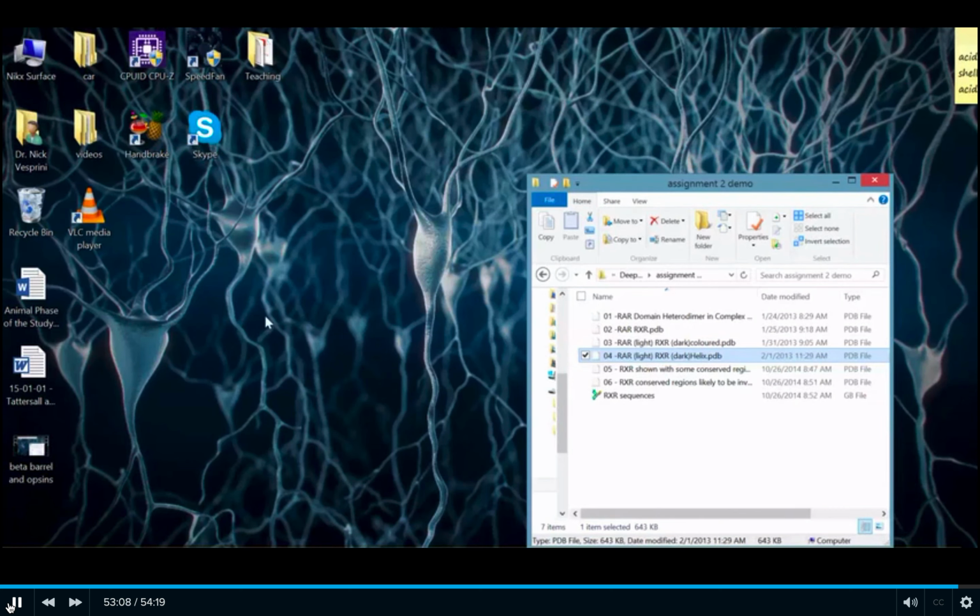The key is that your statements have to be supported by some type of analysis. And for that analysis, we either use BioEdit or DeepView. Most of the time, we'll be using DeepView quite heavily. If you're going to propose a change, it has to be justified. You can propose any mutation. It's just a random fluke in evolution. That's fine. But you have to provide justification for your hypothesized results.